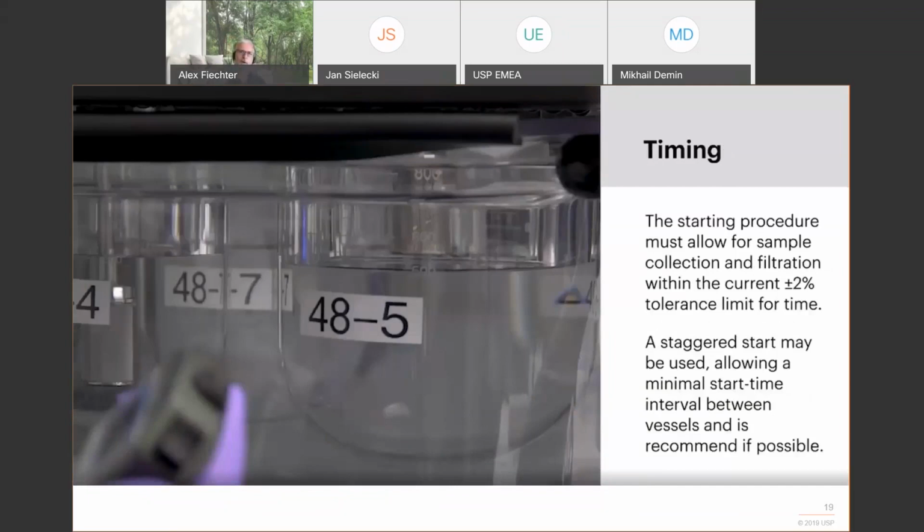So it's on the verge of that dissolution curve going up very shortly. So the time tolerance of plus minus 2% at 30 minutes, which is 36 seconds before and after 30 minutes, you need to take the sample of all 6. If you have a 7-station, 8-station dissolution tester, that you assess those stations as well with PVT, the time gets even shorter. Hence, the recommendation to do it staggered as well.